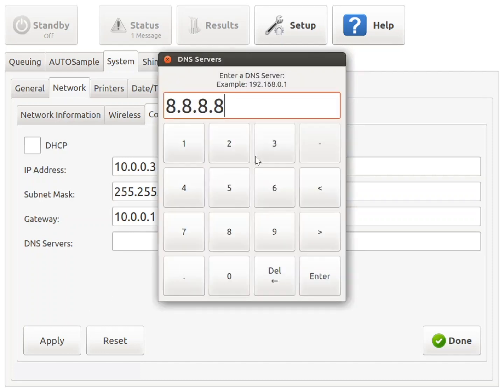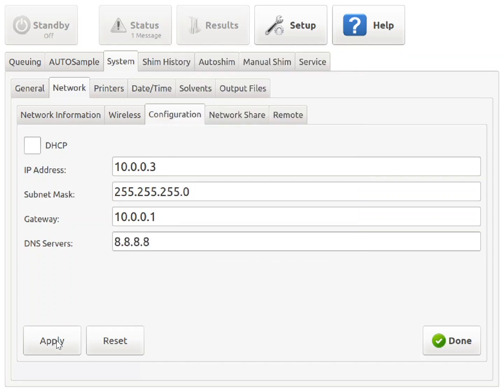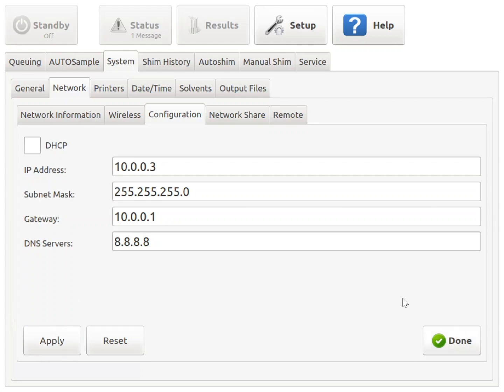Click on Apply Settings. And then Done. Note that I won't be clicking on Apply in this scenario because I'm not connected directly to the spectrometer. But in a situation where you would be, you would click Apply, Done, and that's it.